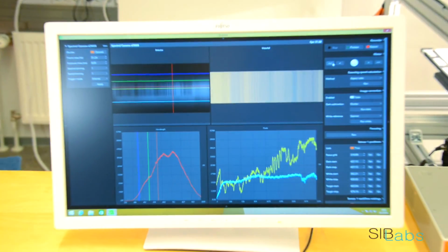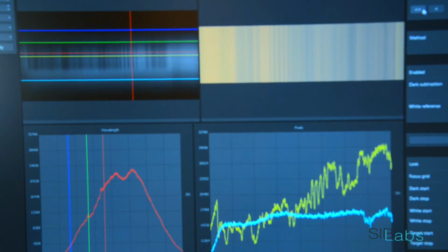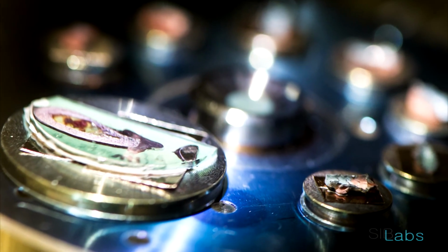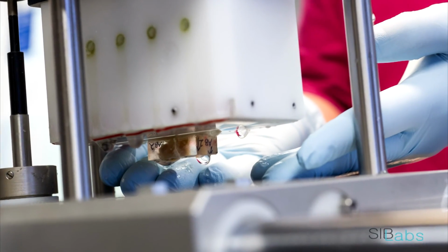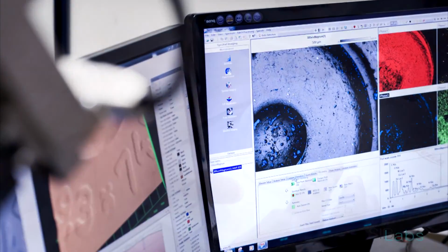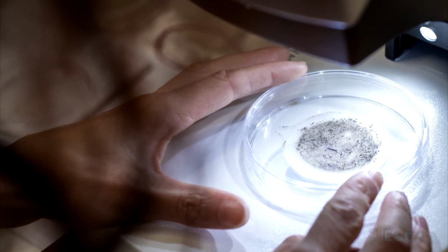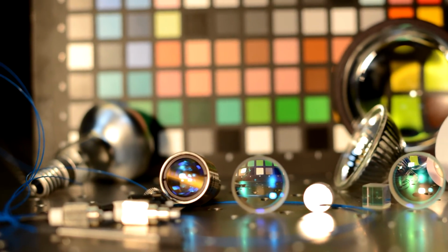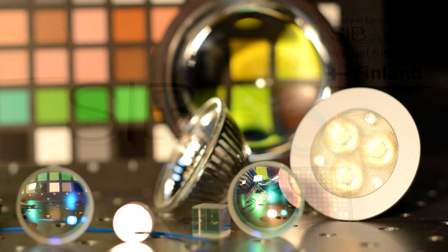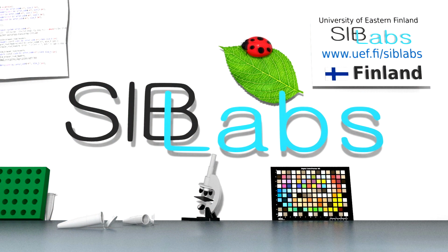Now, the spectral imaging system we just presented is not only very accurate and fast, but also expensive. However, do not worry. You must use such an accurate system only at the research stage. After you have found spectral signatures for your particular use, you can build more simple and inexpensive system, for example using LEDs or optical filters to estimate spectra.